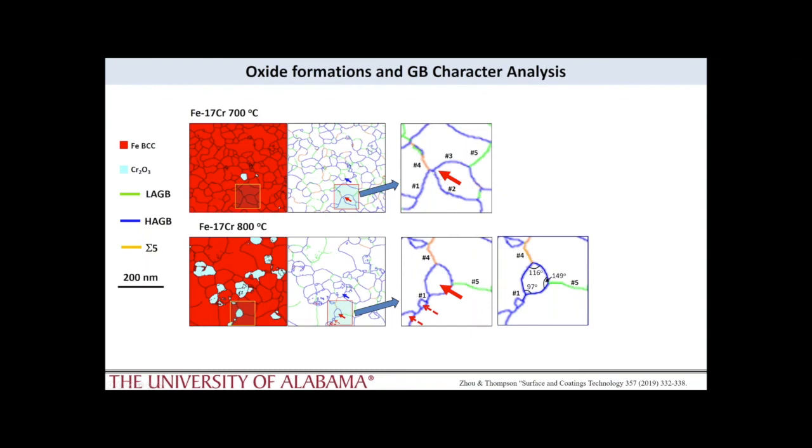These high angle grain boundaries likely provide the fast track diffusion paths for the chromium to meet at a triple junction and then to react. And the fact that this is a high angle grain boundary, and we see chromium, probably means it has a higher chromium content, which we've already seen from the cross-correlative atom probe work I've shown, as compared to a special character boundary. That higher chromium content allowed this high angle boundary to precipitate out additional chromium precipitates, where these other boundaries didn't show this, because they were special character boundaries, as revealed through the PED work that we did.